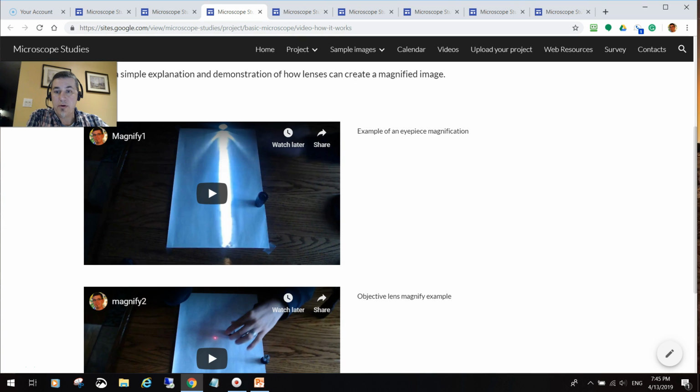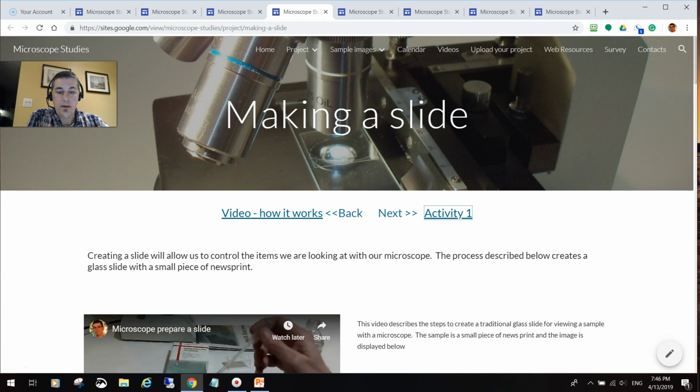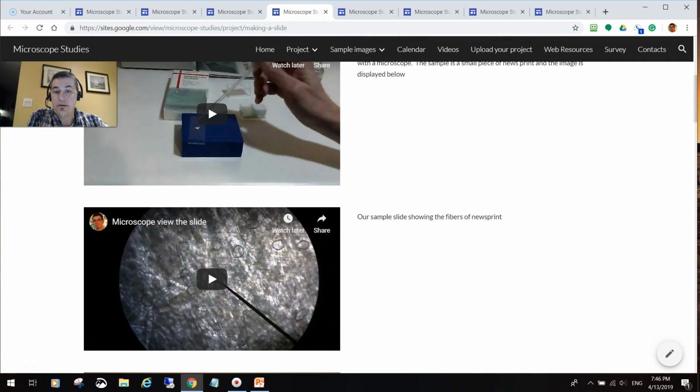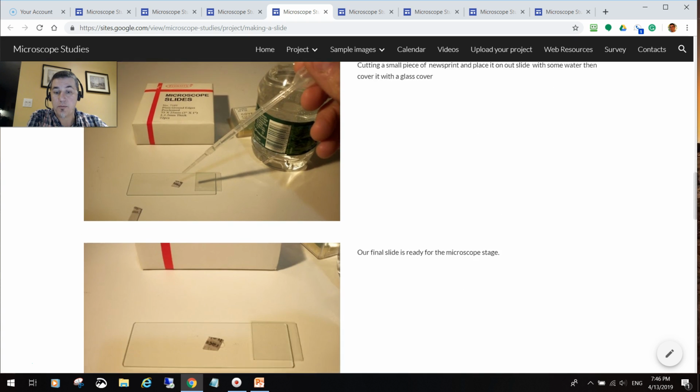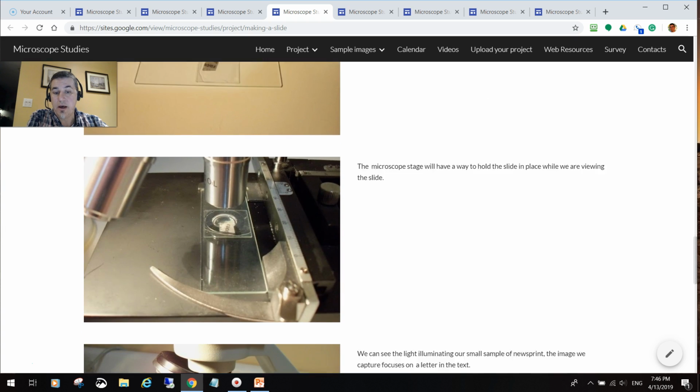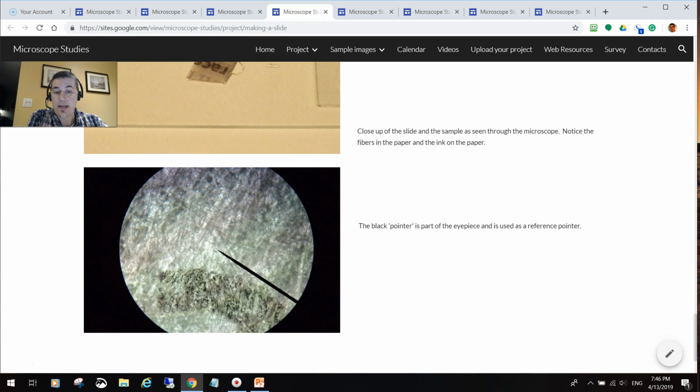The microscope had lots of embedded videos. Like I said, the one to describe how magnification worked with flashlights and with optics. The actual process of building an actual slide, so not only in an animation form, but in a step-by-step, block-by-block form to show the students how it's done and prepare them if they wanted to actually make slides on an actual lab microscope.